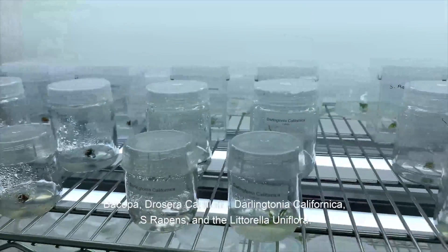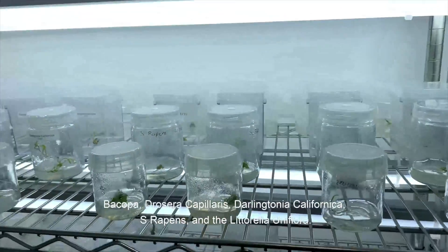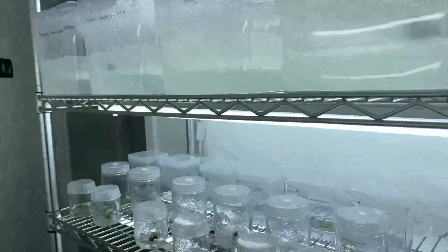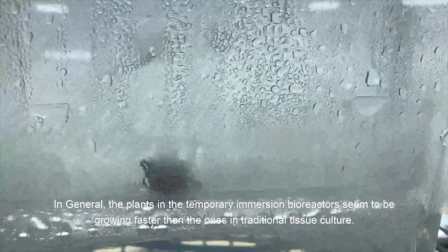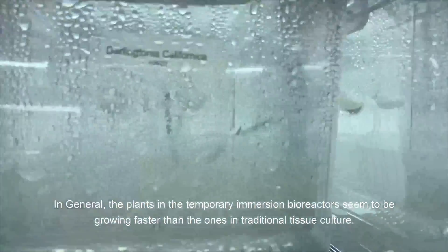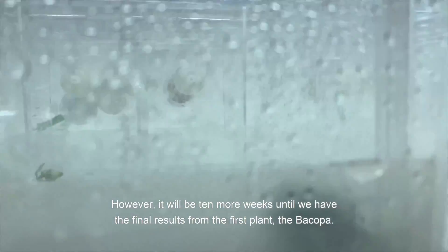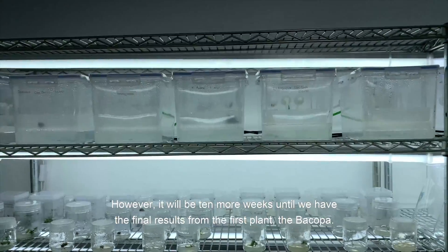Here are the rest of the plants: Bacopa, Drosera capillaris, Darlingtonia californica, S. rapens, and Littorella uniflora. In general, the plants in the temporary immersion bioreactors seem to be growing faster than the ones in traditional tissue culture. However, it will be 10 more weeks until we have the final results from the first plant, the Bacopa.